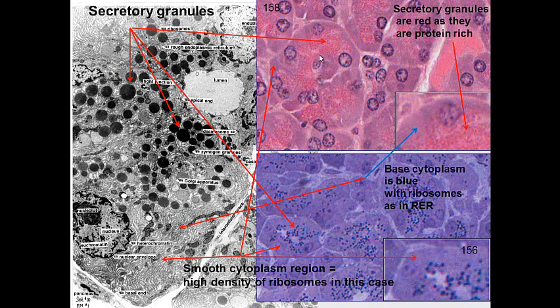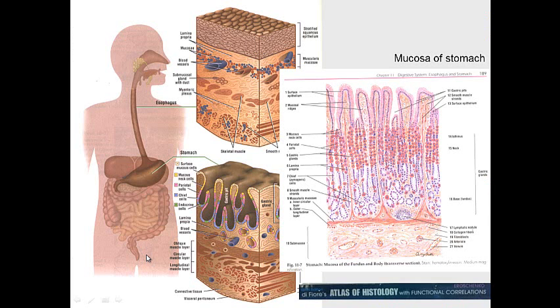Comparing H&E, toluidine blue, and electron micrographs: the dark granules visible in H&E correspond to the same granules in toluidine blue and are confirmed at the EM level. A lumen is visible where cells secrete into the exocrine component of the pancreas. In toluidine blue you can see the granules near the lumen, and the swirls of rough endoplasmic reticulum in the basal cytoplasm, which appears as a blue tint in H&E due to ribosomes - just as the nucleus is blue because of nucleic acids.